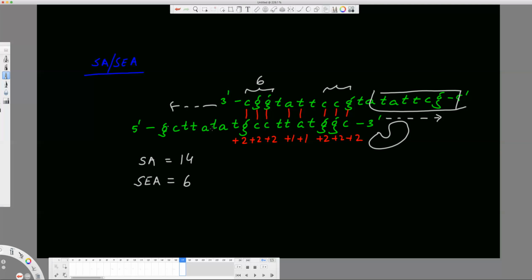Now, if you invert it, you can think of a scenario where sequences are hybridized like this, where the 5' end is actually having some complementarity. Now, you might say that it can recognize here, but the synthesis doesn't happen in this direction, right? It only happens 5' to 3'. So 3' is this way, and it happens in this way. This way, there's no DNA synthesis. So this 5' end annealing is irrelevant. This is why we look for 3' annealing.